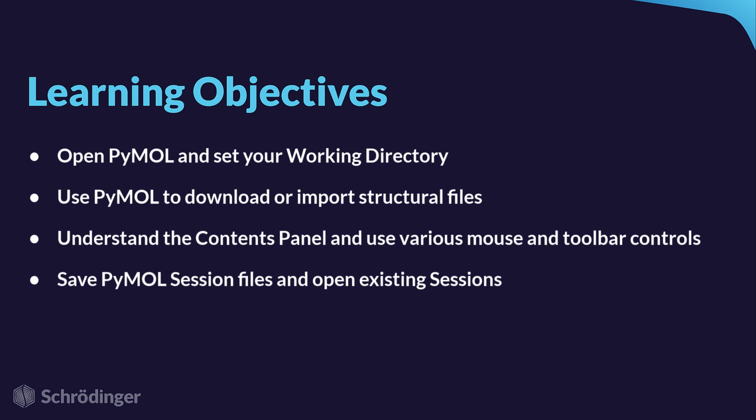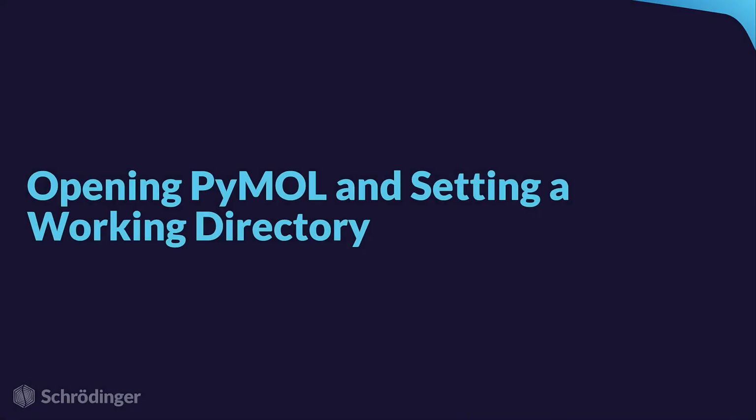If you're already familiar with PyMOL, this might all sound quite straightforward, but as with all of the video tutorials in this course, we will be using PyMOL 3, so there will be plenty of new features and terminology that you won't want to miss. Let's get started.